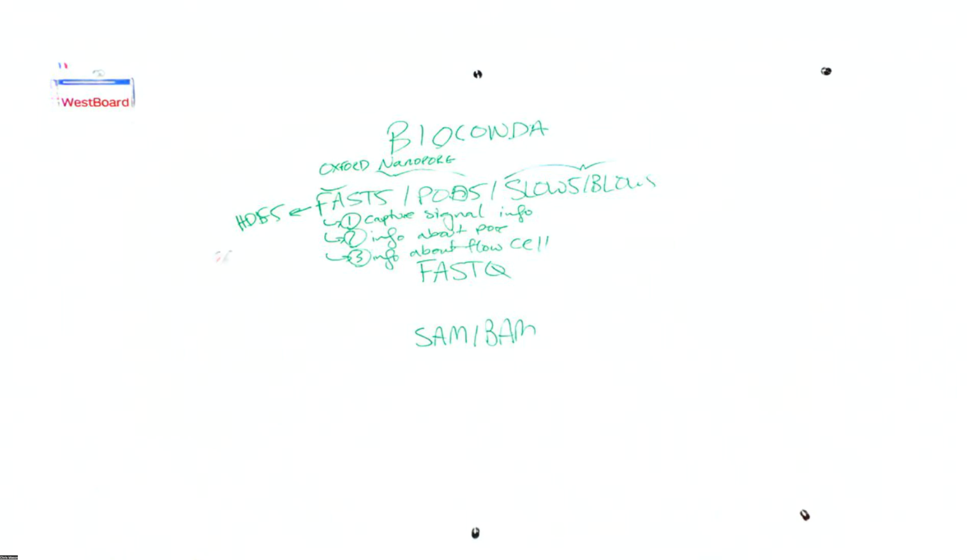Not as much. So HDF5 can be thought of as analogous to JSON, where in essence, your information is organized into specific properties. So instead of having an entire row or a column that has all the information that you're interested in, you have this format that looks like a dictionary in Python, where you have keys which contain each individual attribute that you're interested in about a specific run, and then values that represent the data specific to the read of interest. And typically, the way that the HDF5s slash JSON adjacent files are broken down is on a per read basis.